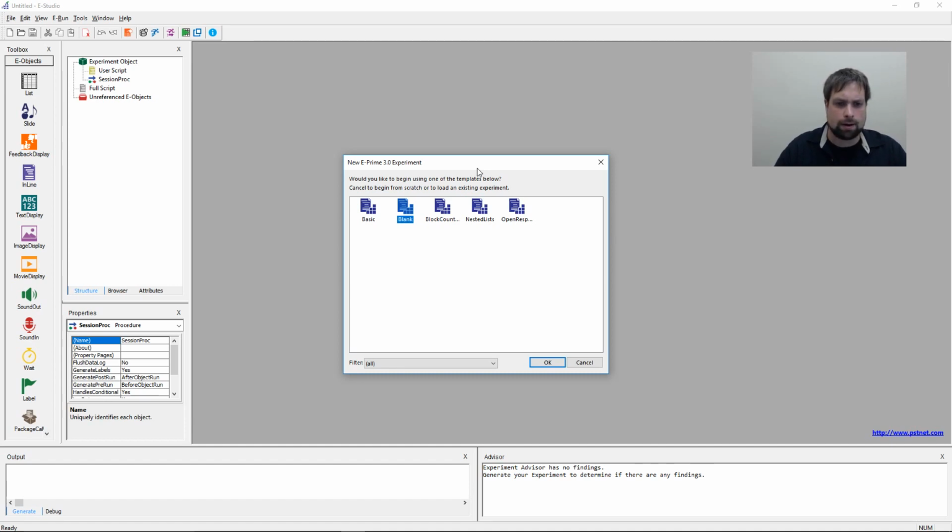And I also have a better description of some of the hardware that we're using. We know some people had requested more of an explanation as to the hardware setup. I did have that chart, but I'm able to actually go in a little bit more depth about that today. So we actually have two cables that we're using today for Biopac. The first one looks a lot like this. This one is something that we made in-house. This end goes into the Kronos auxiliary I/O port, and this end goes into the DB25 of Biopac.